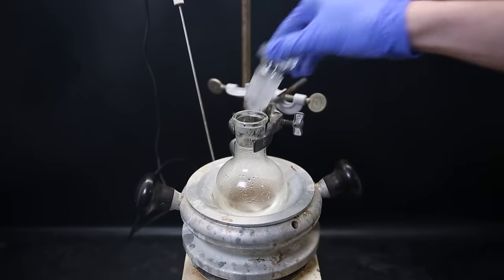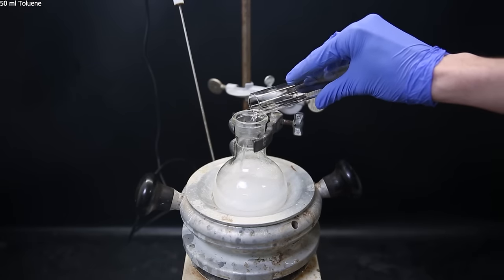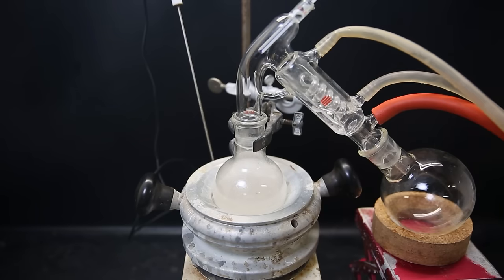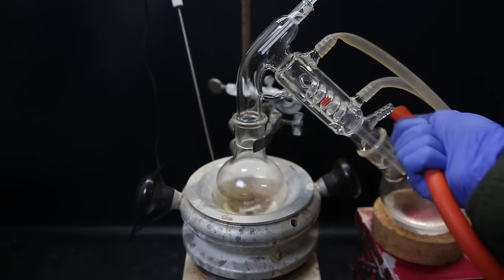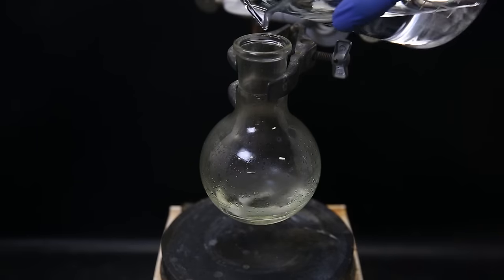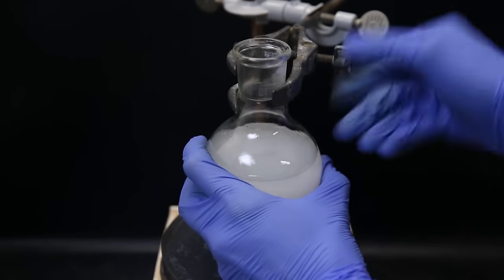I come back after 3 days, and the reaction should be finished. I then add 50 ml of toluene, which will help in azeotropically removing water from the mixture. So I set it up for short path vacuum distillation and removed all of the solvent. Afterward, I am left with a pale yellow oil that contains the product and some impurities. So first, I will have to remove some of the impurities and the remaining selenium dioxide and salicylic acid. So I add about 200 ml of diethyl ether to dissolve it all and then move it to a separatory funnel.